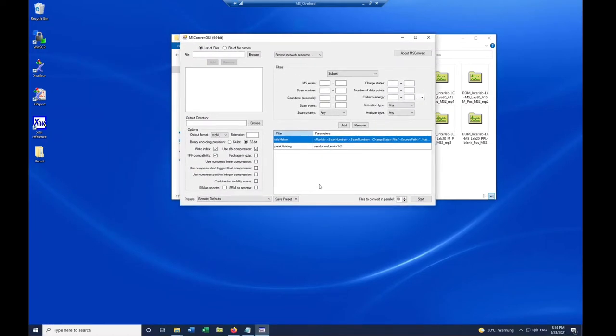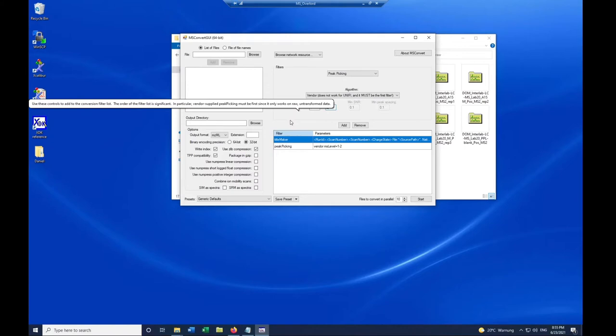and then a small window should appear that basically has a couple of settings in here, like a file selection tab. So most importantly, for the conversion to mzML, what we want to do is also peak pick our profile mode data to centroid. So in case by the default settings peak picking is not selected, then you can select this through this drop down menu, peak picking, and then it's most important that you select MS level 1 and 2 if you have DDA MS-MS data. As an algorithm, I use here vendor, which is I think the default for at least Thermo data.